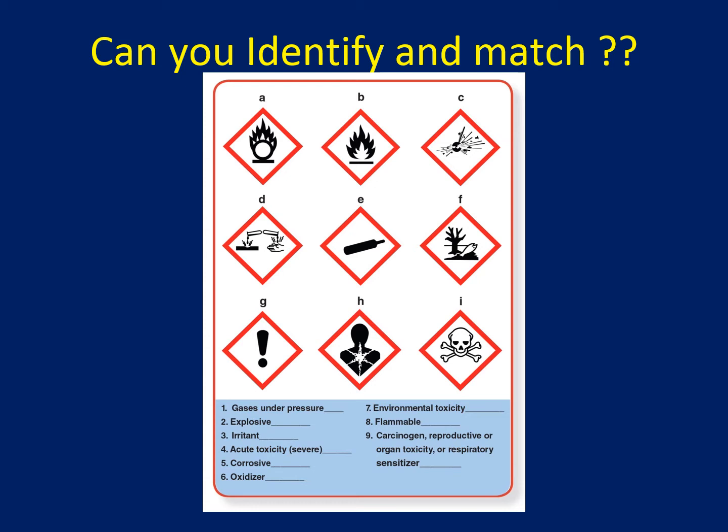So I guess you know a few of them, right? So, skull and crossbone. Is somebody familiar with these symbols? Special army forces have this one, right? If we have this kind of symbol, we call it a toxic symbol, and then you can see some other symbols.